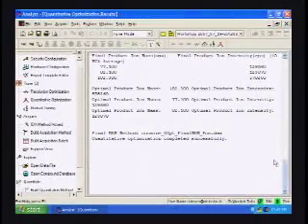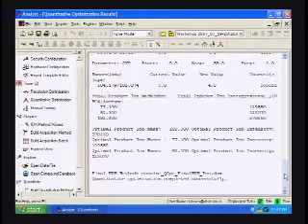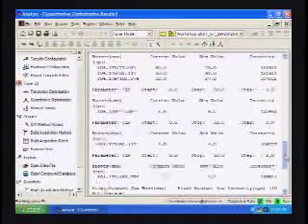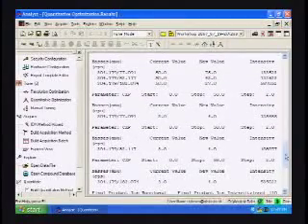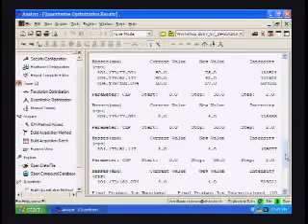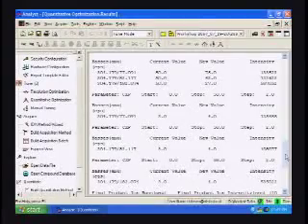We also want to keep this text pane, which is going to show you the individual transition data that you're going to use to build your method, because each transition that you want to include has its own specific set of criteria that have to be put in there, and that's where you get this data. We can go over this data when we discuss actual method development.